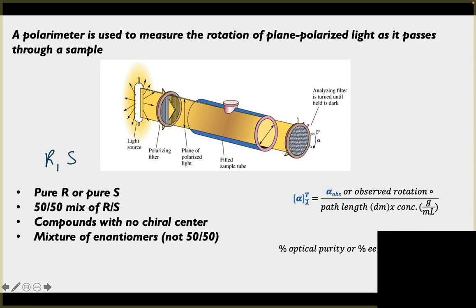And this ability of molecules to rotate plane polarized light can be observed using a polarimeter shown here in this picture, where you will have a light source and then you'll have two filters, a polarizing filter and an analyzing filter that you can rotate, and a sample holder that will contain your chiral molecules. So what a polarimeter does is that it measures by taking light, polarizing it, and then the sample rotates the plane of polarization, and the second filter will be used to determine how much this filter needs to be rotated until no light is passing.